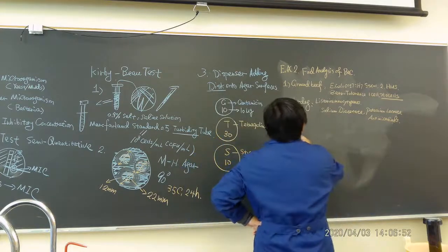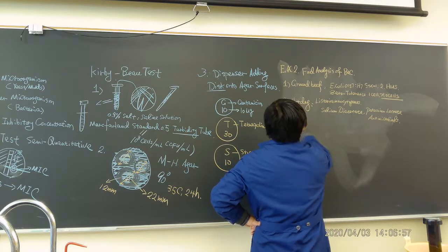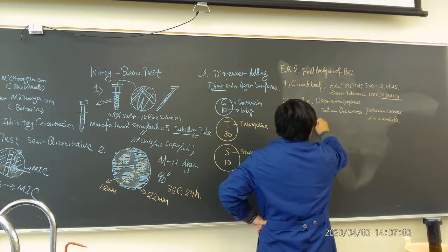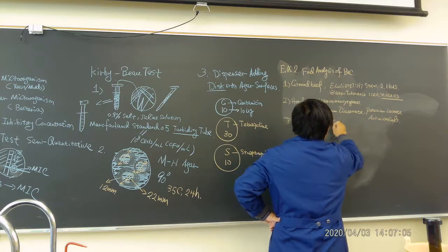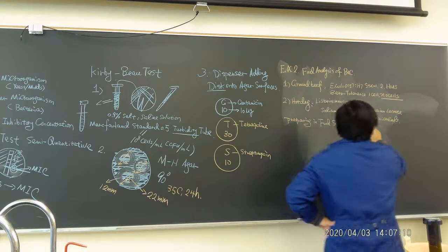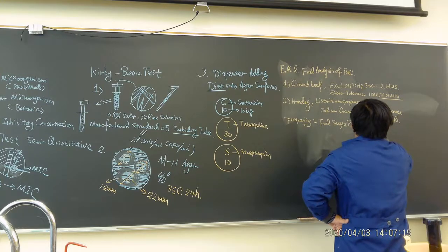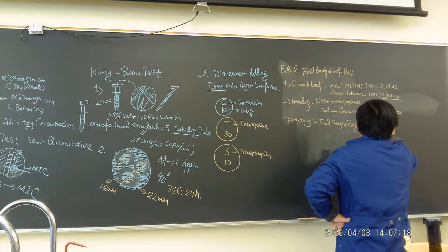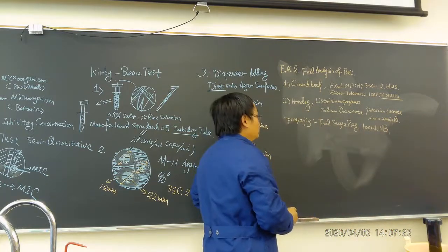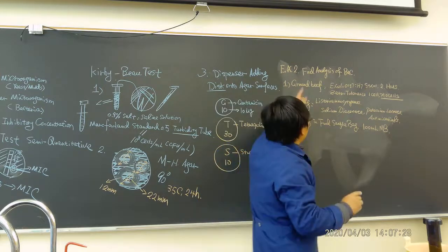The steps are very simple. We're going to do the food preparation. We're going to be preparing in a food sample bag. Basically, we're going to add 100 ml nutrient broth in there. Then for different food products, we do it differently. For you guys, we will be doing these 2.